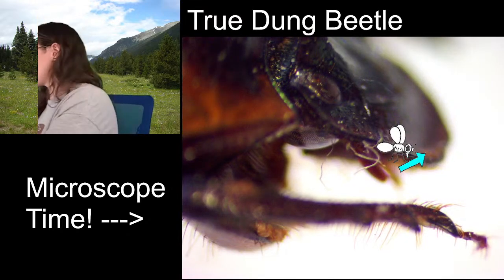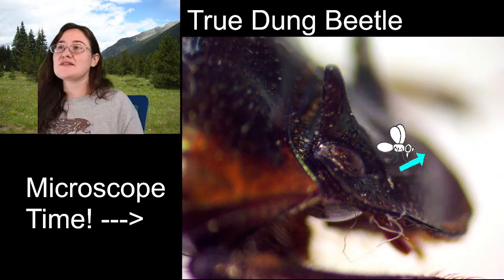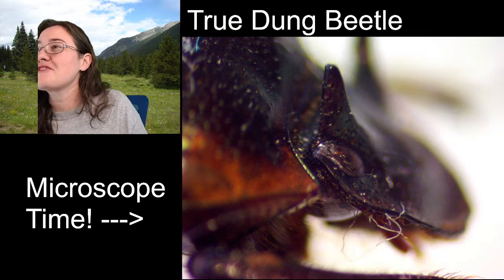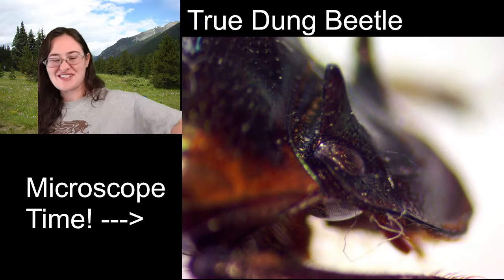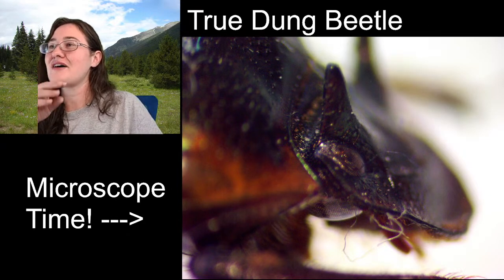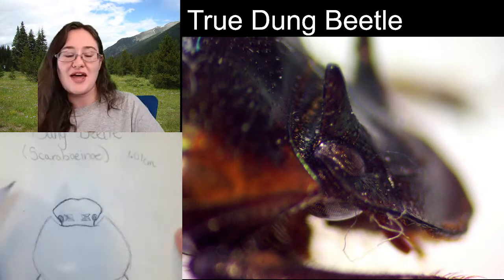I do remember this about playing with him under the microscope. His depth is a little interesting to work with because this beetle is thick. From the side, I just wanted you to be able to see those horns so that you had an idea of what they look like from the side too. And you can see that that flat disc of a mouth almost stays flat the entire way.